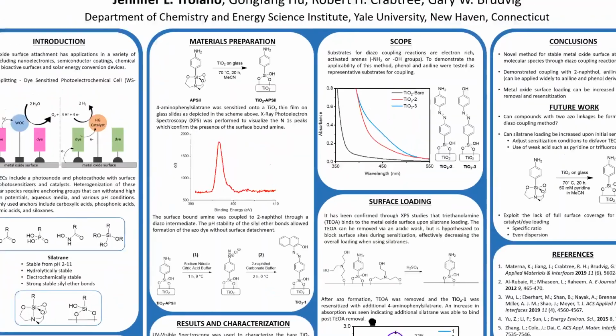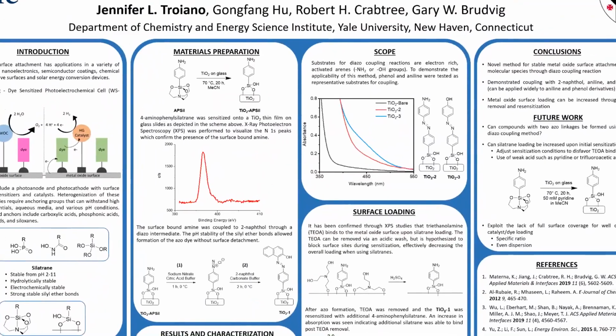Diazo coupling is applicable to many activated arenes, typically containing amines or hydroxides. To demonstrate its widespread applicability, we coupled both aniline and phenol to the surface-bound aromatic amine. Although some of the absorbance is masked by the TiO2 film, the increase in absorbance in the region shown indicates successful coupling.